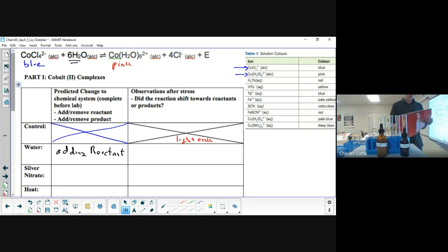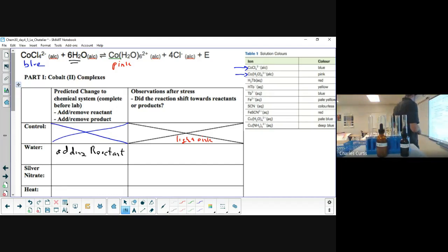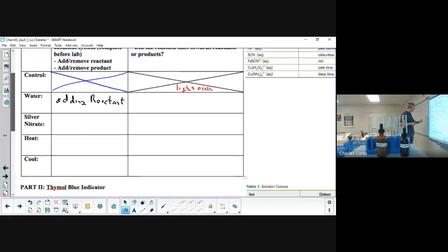Now, you're really not going to need to, because as a teacher, I'm going to go through the key ones that the tests and the diplomas would cover. So I'm referring to this solubility table. If you check that table, nitrates are soluble with everything, but silver precipitates chloride. So that chloride ion is going to turn into silver chloride and fall to the bottom. It's not going to be removed from the test tube, but it's going to be removed from the equilibrium aqueous phase. So adding silver nitrate is going to remove a product. And again, we're going to look at the end of all of our experiments, is there a pattern for adding a reactant? Is there a pattern for removing a product?